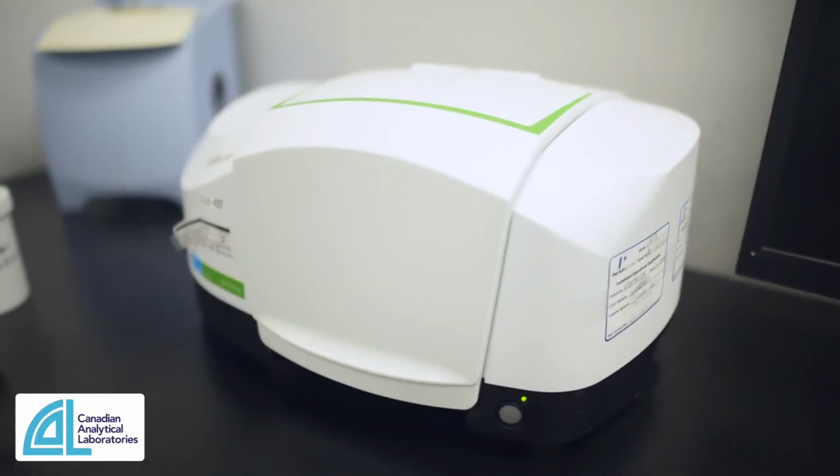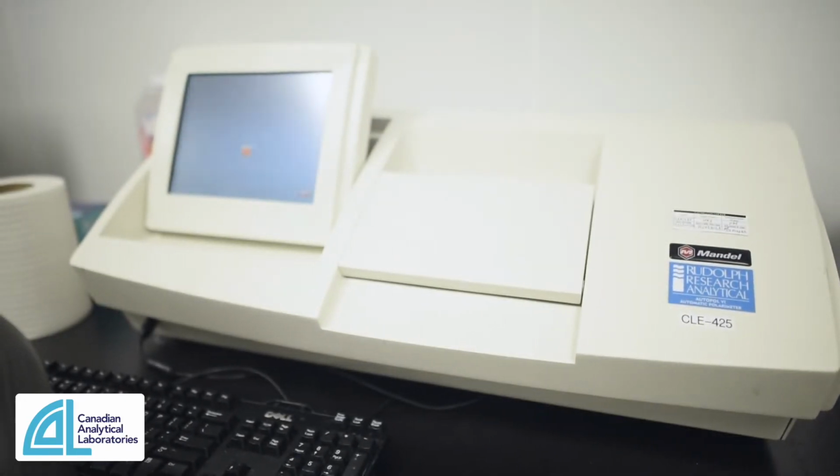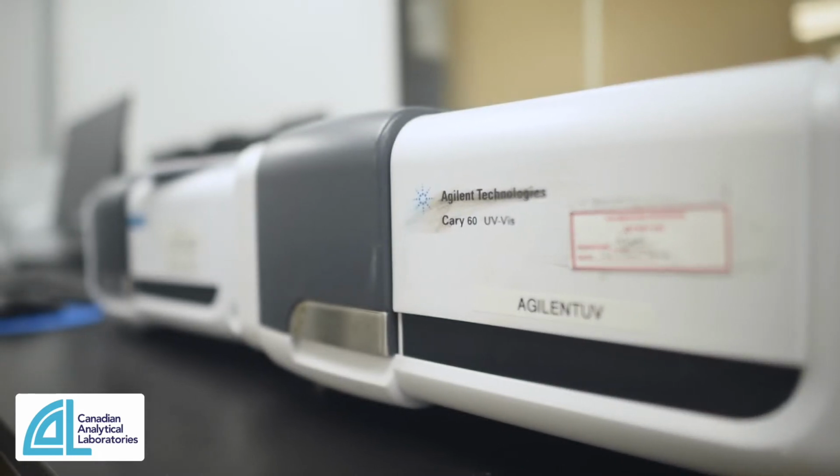So this is our spectroscopy room. We have Fourier transform infrared with ATR assemblies, so we can do direct IR measurements on finished dosage forms. We have a polarimeter here for optical purity. We have another FTIR on this side. We have a melting point apparatus. We also have a near IR, and this is especially important for botanical identification, where we build a library of different botanicals and compare correlations between the two. We have 2 UV spectrophotometers here on this side.